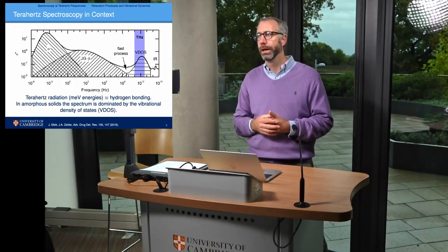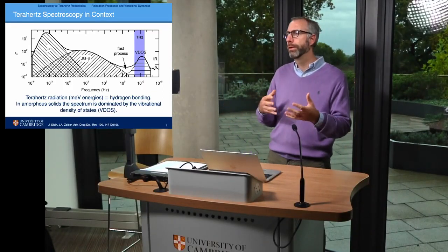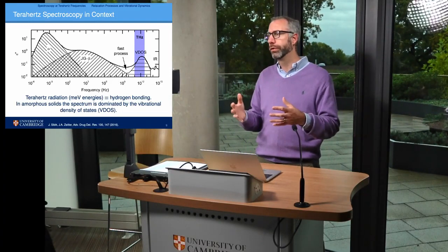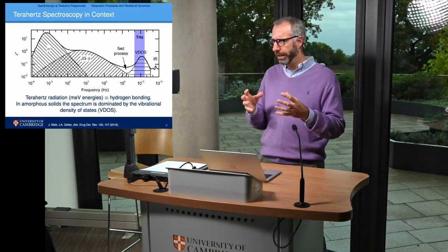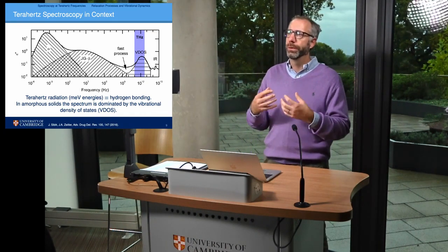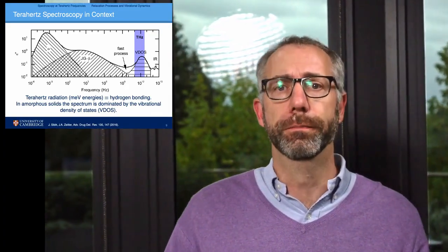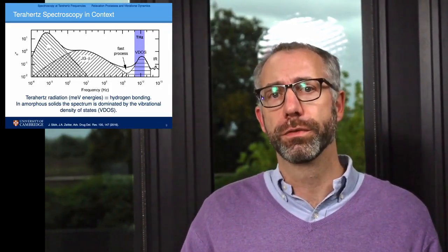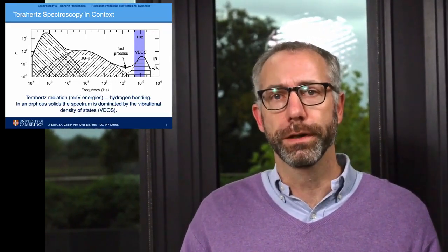In between, at terahertz frequencies, well, we have a photon energy of a few millielectron volts, or around about 1 kilojoule per mole or so. The radiation is sensitive to subtle changes in hydrogen bonding, as well as weak dispersive forces. So we observe complex vibrations of entire molecules or large parts of them. And by exciting organic molecular materials at these energies over a wide range of temperatures, we can study the presence and nature of interactions between molecules in a unique way.